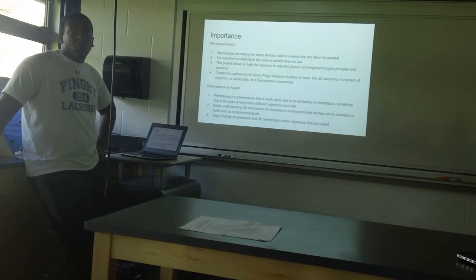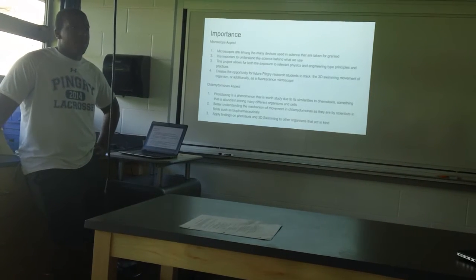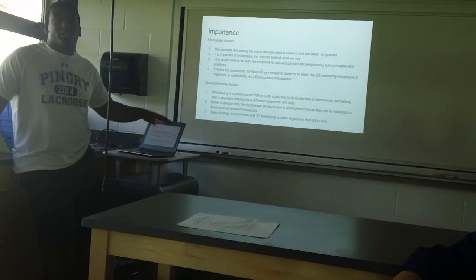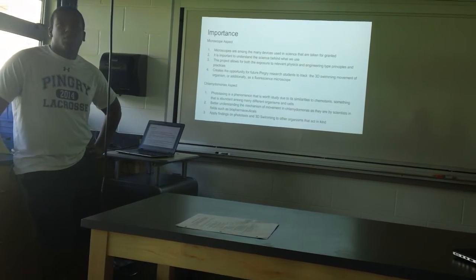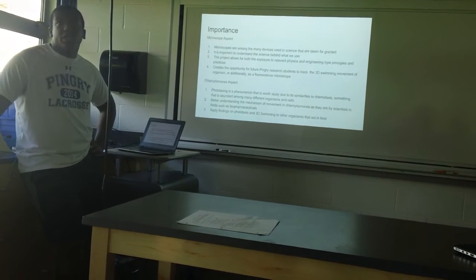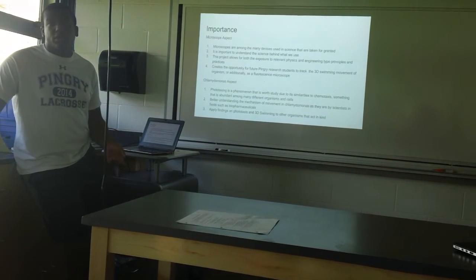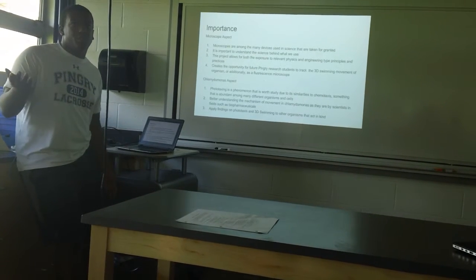What our plan is? Well, our project is a chimeric project in that a big part of our pull is the physics aspect, which is why skipping to the bottom part would shortchange the project as a whole. Okay, all right, fine. We just want to know what your plan is. Okay, so what we'll be doing is using the Chlamydomonas first as a test to make sure that our microscope works, because it would be moving around.